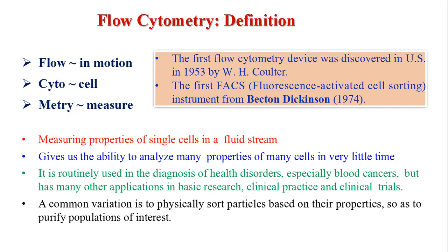For routine use in the diagnostic laboratory to diagnose health disorders, mostly focusing on cell types and to detect blood cancer, this instrument is a prerequisite. But it has many other applications in basic research, in clinical practice, and in clinical trials also.